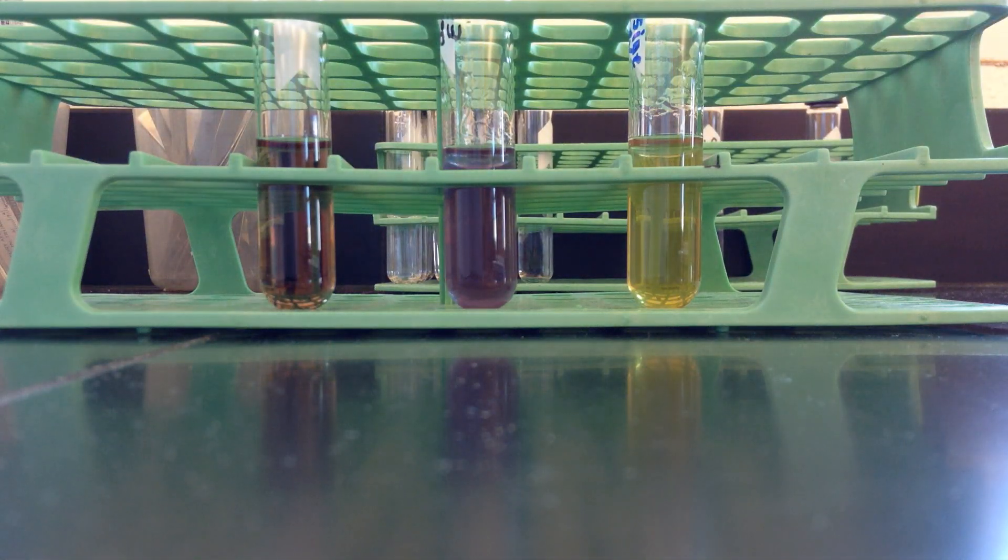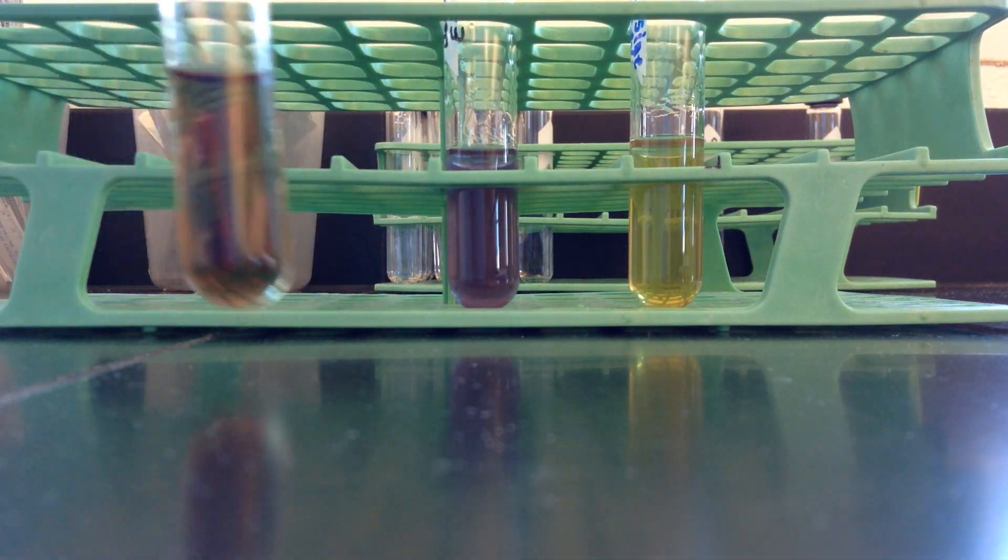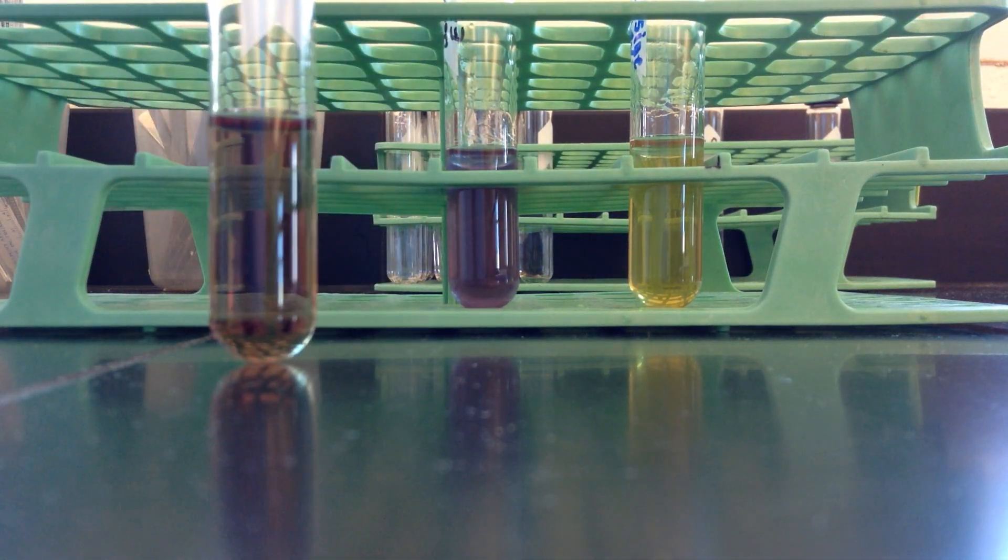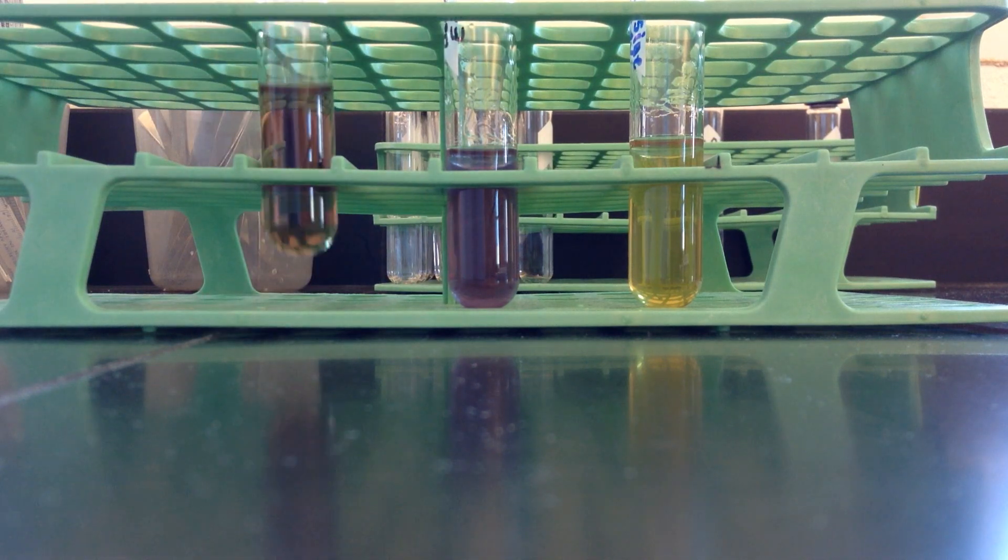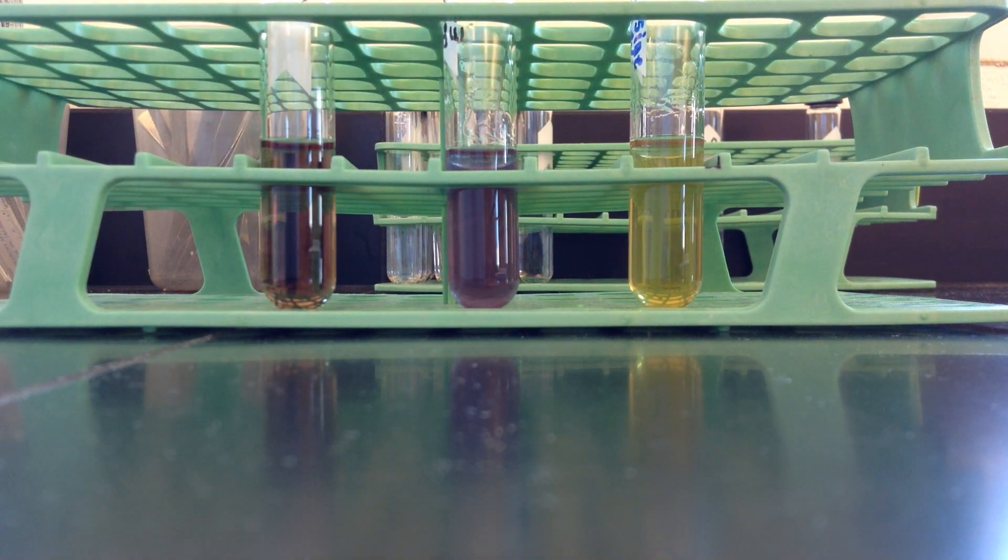Here is an un-inoculated tube of lysine. I want you to see it does kind of have a purplish cast, but it's kind of a greenish purple. The reason I want to mention that is because it actually turns purple as a positive as well, so make sure you're aware of where it is when you begin.